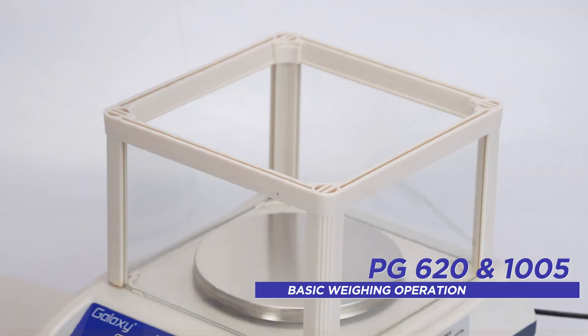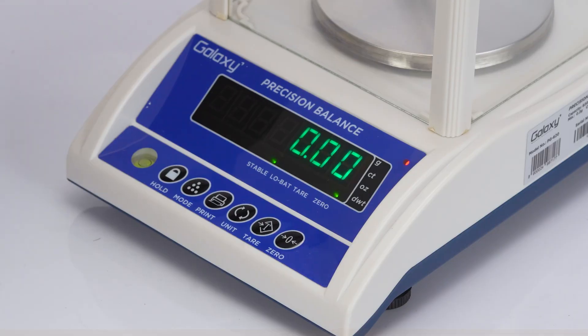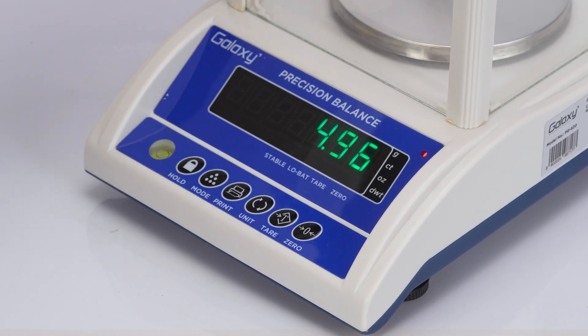To weigh metallic items, place your silver chain on the pan and wait for the stable indicator before reading the weight.